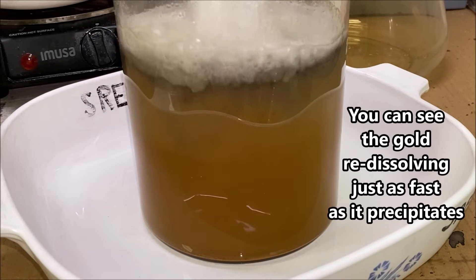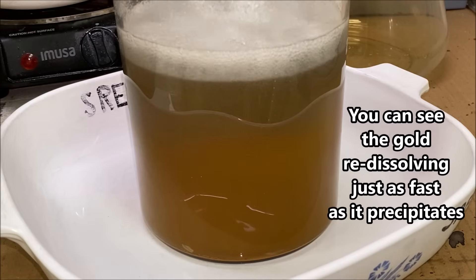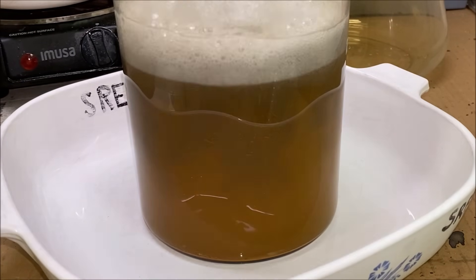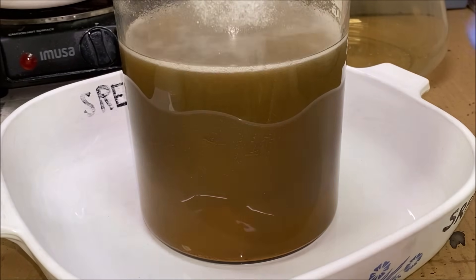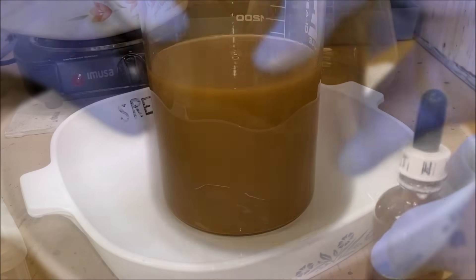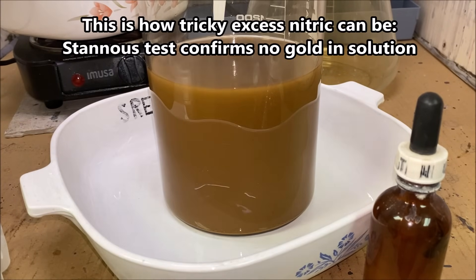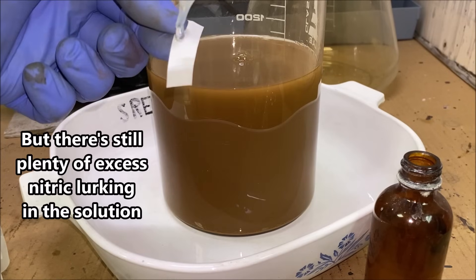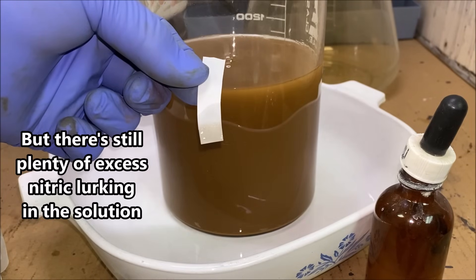It's looking like it might still have a little bit of excess nitric in there. See how it continues to bubble after the reaction. I'll do another Stannous test — this time we should have no stain, which indicates that the gold has dropped completely.